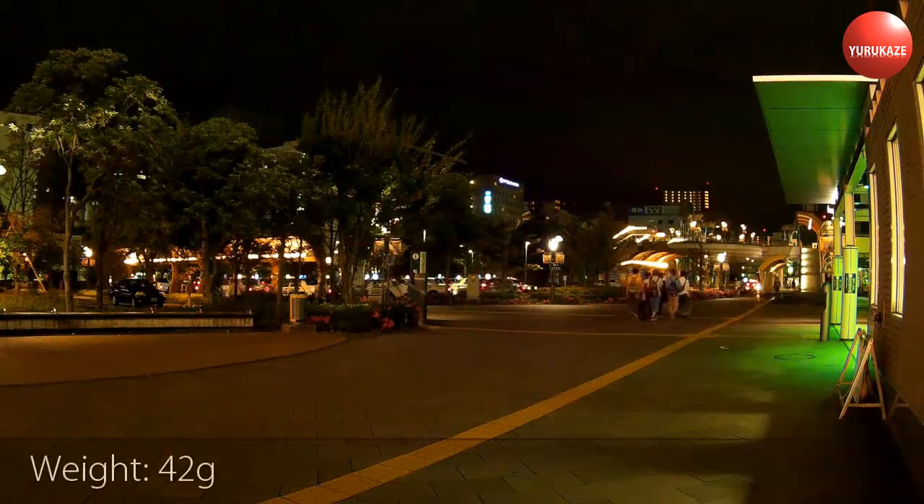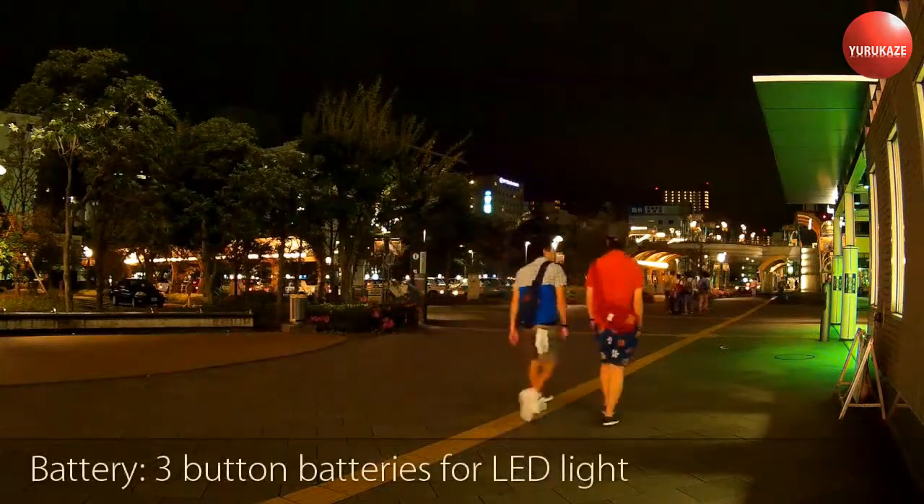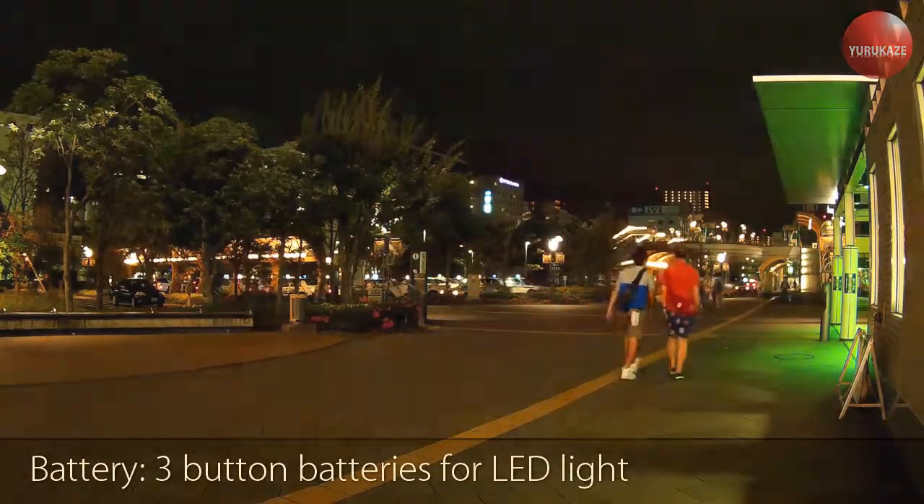2980 Yen. 42 grams. Requires 3 button batteries for the LED light.